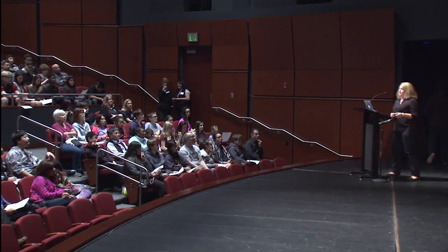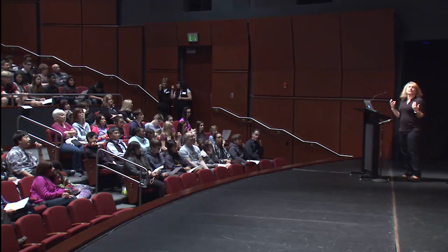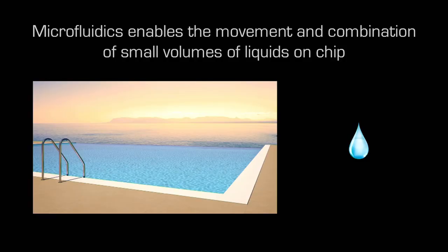Yes. So as Chris mentioned, we have these different systems that we need to connect together. If you think about it, your body is connected by blood flowing continuously. So we need these fluidic interconnections. So how do we do this? Well, what we're going to do is leverage microfluidics. Microfluidics is basically like it sounds. You take small amounts of fluid.